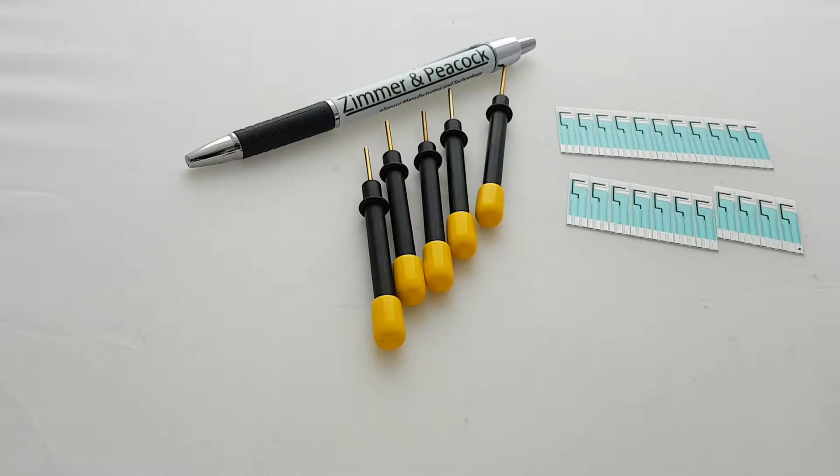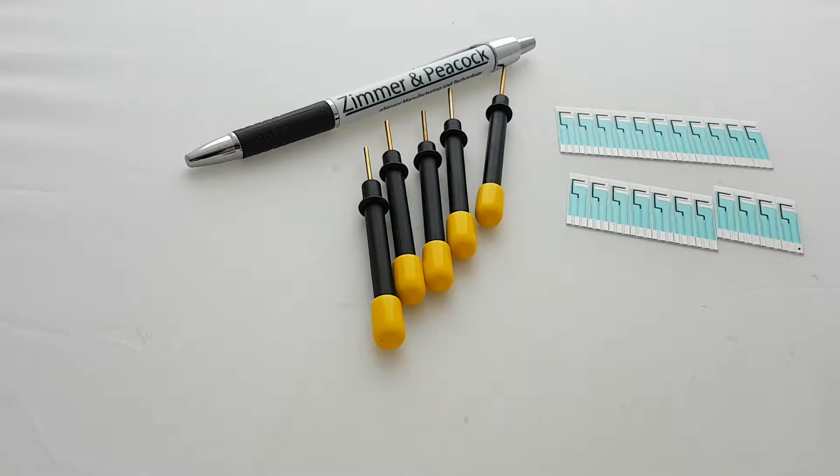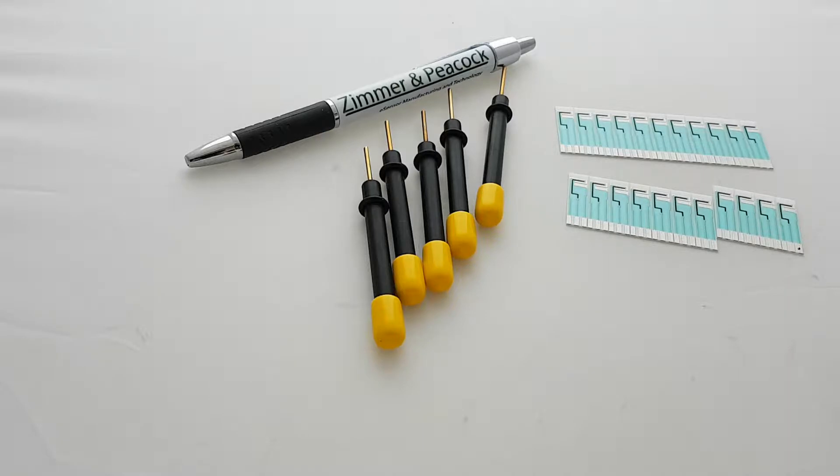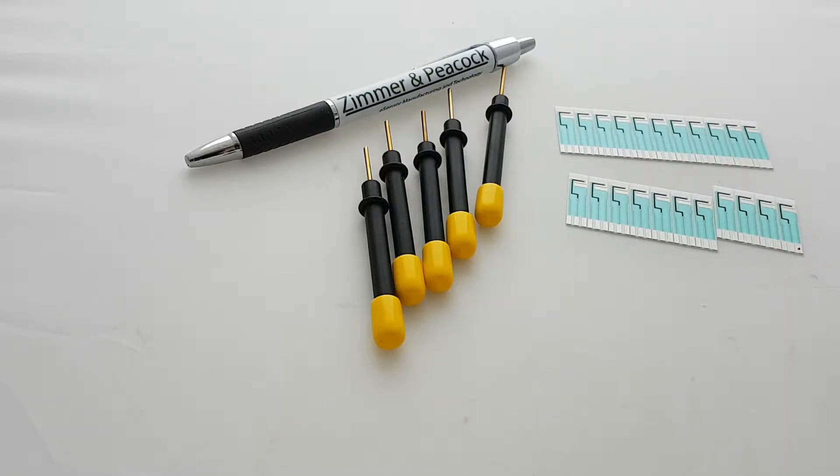Hi, this is a video about glassy carbon electrodes. At Zimmer & Peacock we sell standard products and services in the development and manufacture of sensors and biosensors of electrochemical nature.